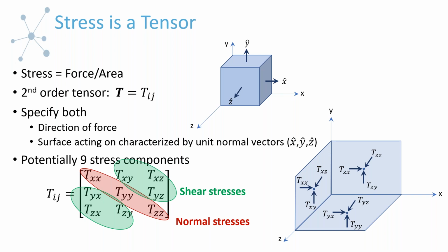Now the off diagonal elements are what we refer to as shear stresses. This is where we're going to be most interested and where we're going to try to simplify things as much as possible. Shear stresses, as we discussed, are basically the motion of the force parallel to the surface. We have the different potential components of the shear stresses displayed in our graphic here, but now we're just looking at motion of the force that's parallel to the surface. And this is the result of shearing the fluid.